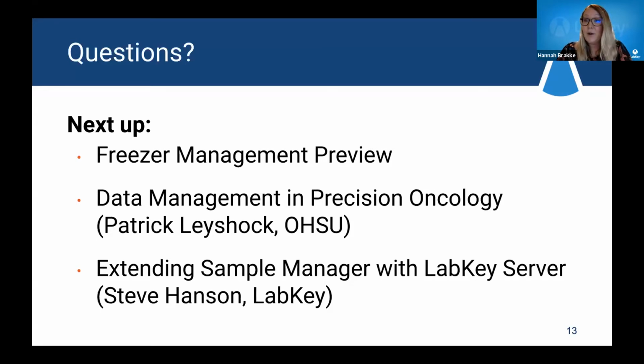Workflow is actually in its own schema, but the assay data that is uploaded in Sample Manager can be copied to a LabKey study in the same way that you would be able to do that in Server. I'm getting a little bit in the weeds here. And I think Steve's actually got a great presentation on this later. I'm actually going to show that at the end.